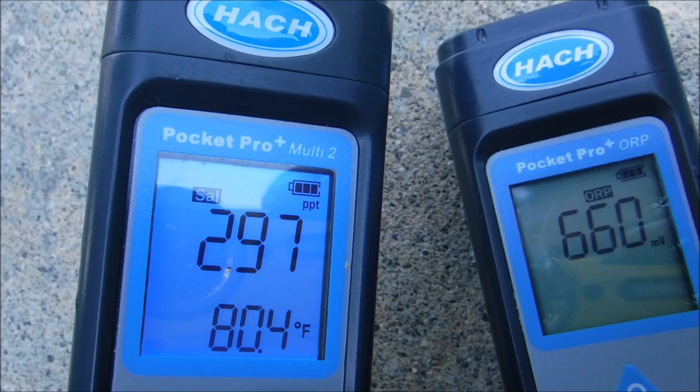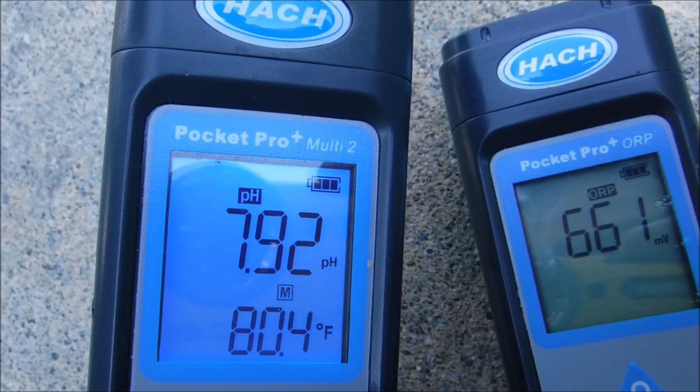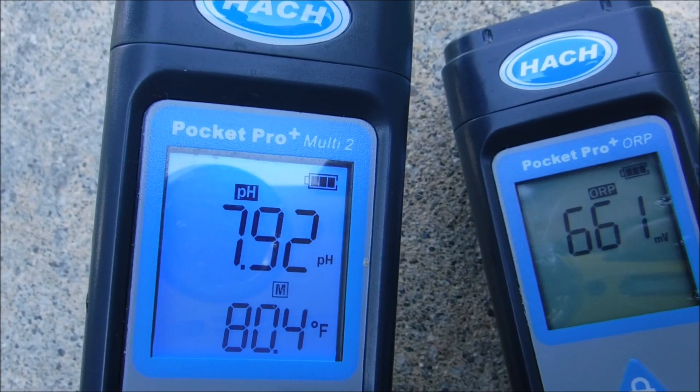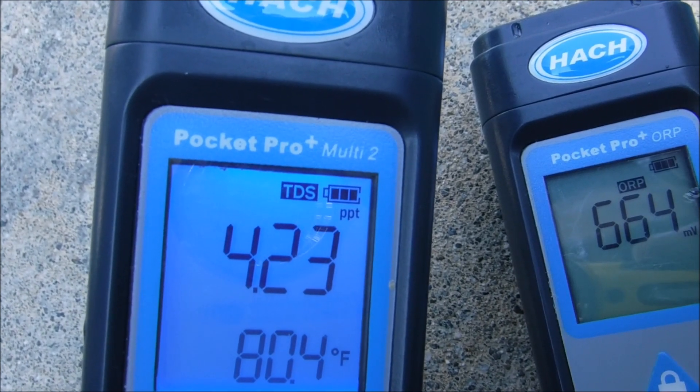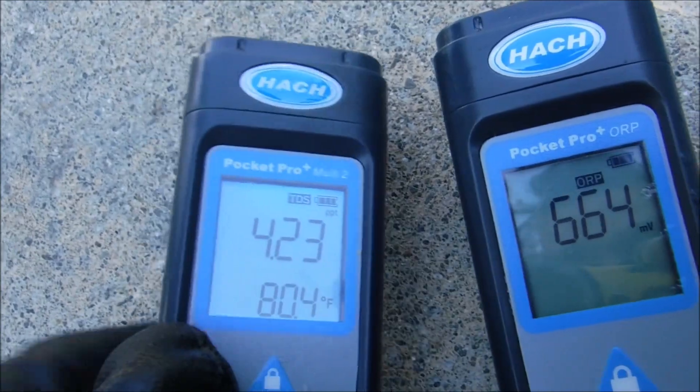Salinity here is at 3,000 parts per million. pH is at 7.9 and total dissolved solids is at 4,200 parts per million — a little bit higher in the salt pool than in a regular pool.